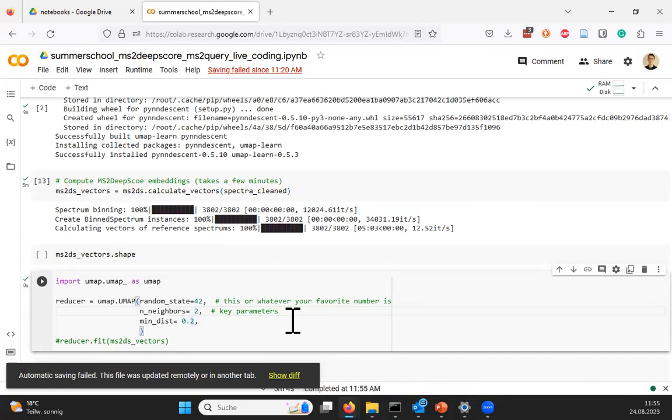We now come to a big problem in this field: there's hardly a way to judge how good your data dimensionality reduction works. So it's up to you to visually inspect how it works. I would recommend setting neighbors to a higher number, like 20 for a start, and the distance, I think anything like 0.2, 0.25, 0.3, 0.4 is fine. So I set it to 20. You can look it up, I think there's a link in there. The higher this value is, the more you look into global patterns, and the lower it is, the more you look into local patterns.